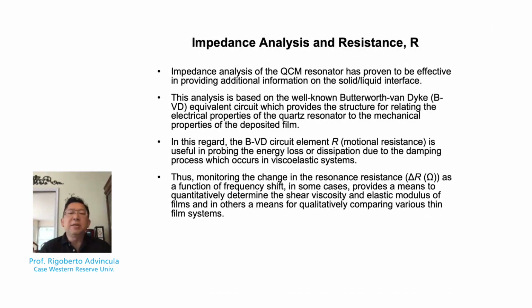In other words, by simply measuring along with the frequency shift the resonance resistance and then plotting them in an XY plot, one can have a distinct differentiation between the viscosity and elastic modulus component of the film.